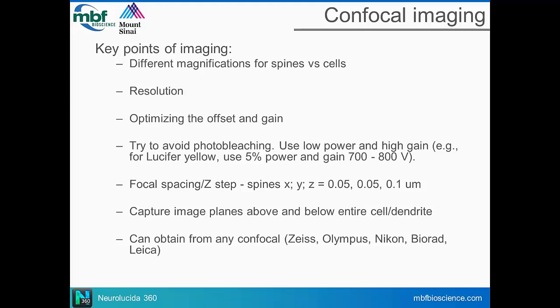The ability to take a montage frees you from being stuck to a single field of view, so automated tools have really come to the forefront to allow you to capture more and more image data and stitch it.